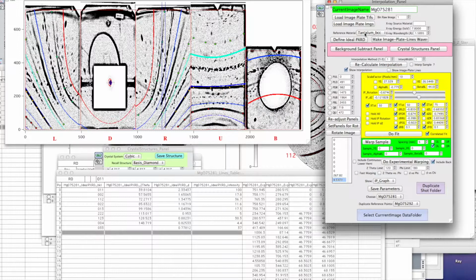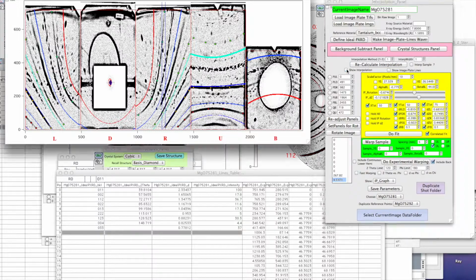Yeah. And then this one, is there something below this line if you remove the interpolation? No, it doesn't seem so. But it's less intense, so it would make sense that you don't see this line from the helium beta, because this line is less intense than this one. That's the helium beta.